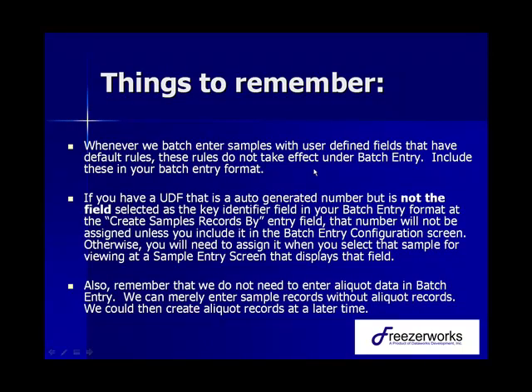So in conclusion, let's remember some things about batch entry, things to keep in mind. Whenever we batch enter samples with user-defined fields that have default rules, these rules do not take effect under batch entry. So include these in your batch entry format. When you're creating a batch entry format and you've got fields that usually you have entered that are default, these won't be created unless you include those fields in your batch entry format, and then place the default entry in your format as well.